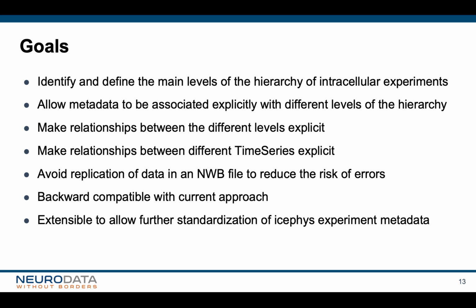We also want to make the relationship between different time series, that is stimulus and response pairs, more explicit. And we want to avoid the replication of data in the NWB file to reduce the risk of errors. And then finally, the approach should be backwards compatible with the current NWB standard, and we also would like it to be extensible to allow further standardization of ICEphys experiment metadata in the future.